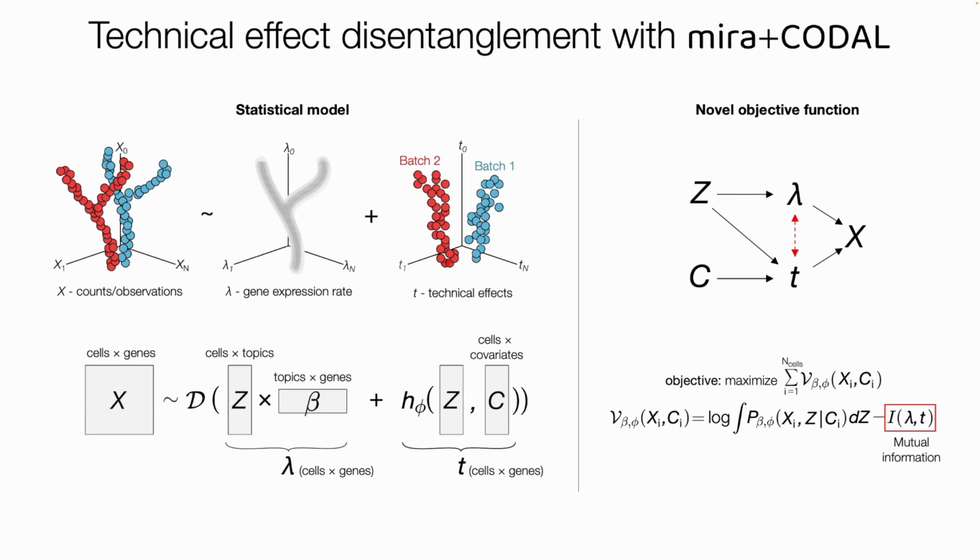Next, we assume that technical effects depend on the specific conditions under which the data for those cells were generated. Those specific conditions are almost always unknown, but since cells from the same batch were presumably sequenced under similar conditions, the cell's batch of origin is a useful proxy variable that describes this effect. Technical effects may also vary according to cell state due to differences in cell size, nuclear chemistry, or some other unknown variable.